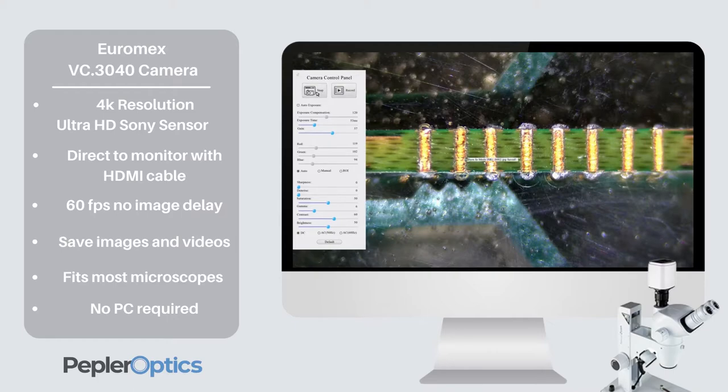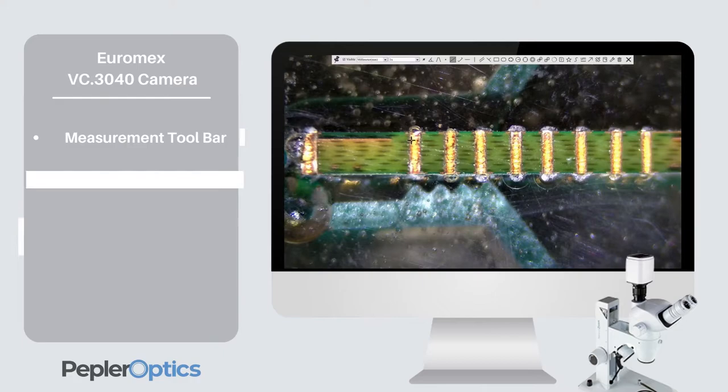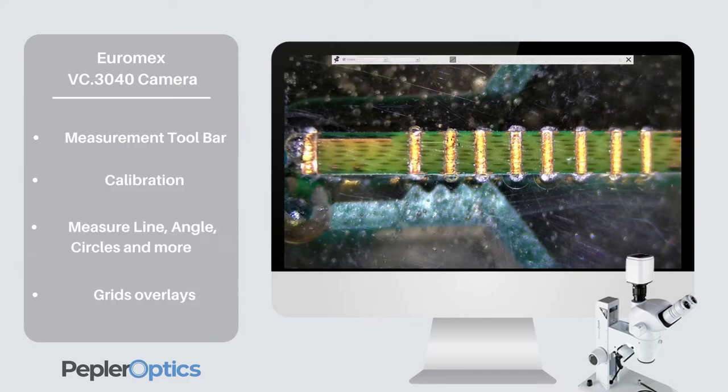You can also perform calibrated measurements and access functions using the embedded software, all without a computer. The toolbar at the top of the screen provides access to the measurement functions including lines, angles, circles and more. You can also add text to annotate your images and then save your work to the SD card or to your network.